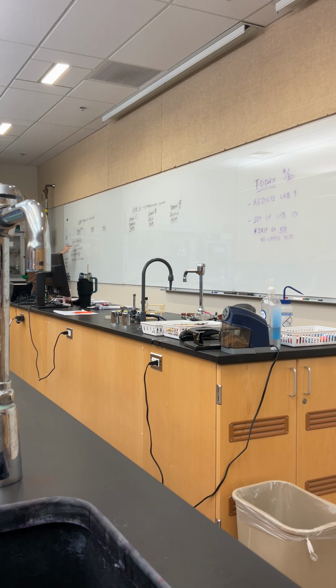So if I'm able to eat the mannitol, I'm going to create an acid, which is going to cause my pH indicator to change colors. In this case, I'm going to turn yellow if acid is present. Does anybody see on their plate an organism who has turned the media yellow? Which one?